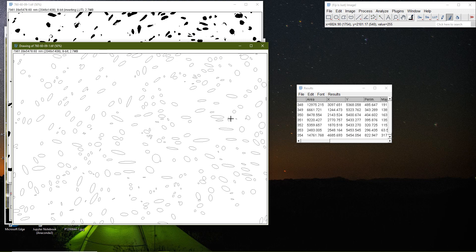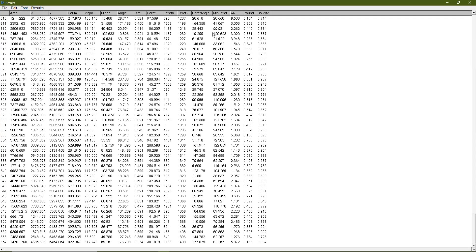The shape of a particle is random, so to measure its diameter, length, and thickness there's no direct way. The software tries to fit an ellipse on the shape of each particle. The best-fit ellipse gives us a simplified shape: the A-axis is basically the length of the particle and the B-axis is the thickness.